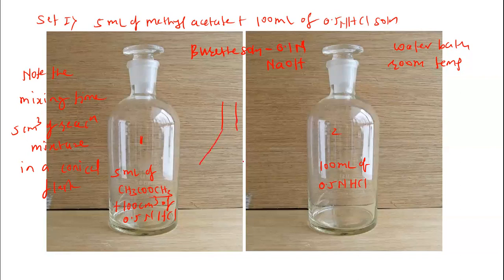Already we have taken ice in the conical flask. First of all, we have to take some pieces of ice here, and 1% phenolphthalein indicator has already been added into this conical flask.